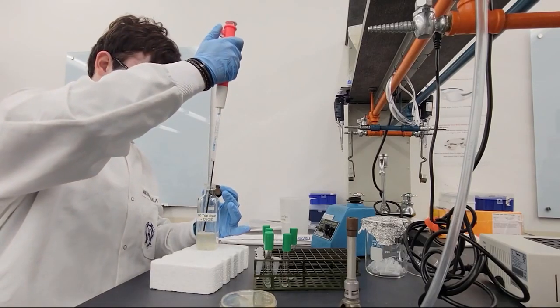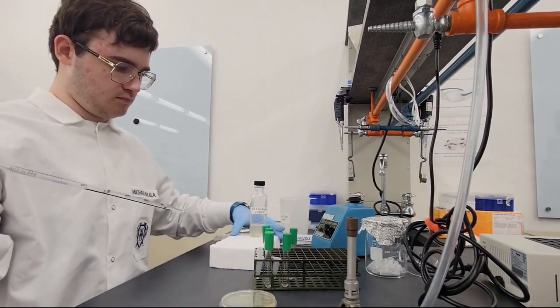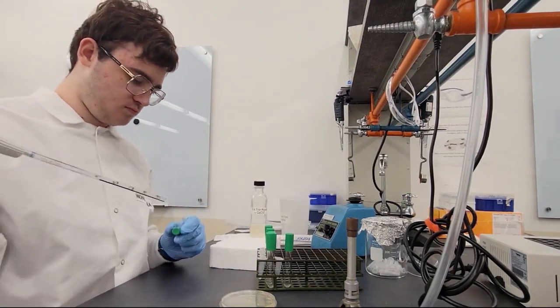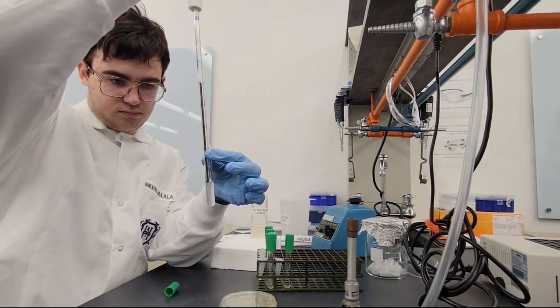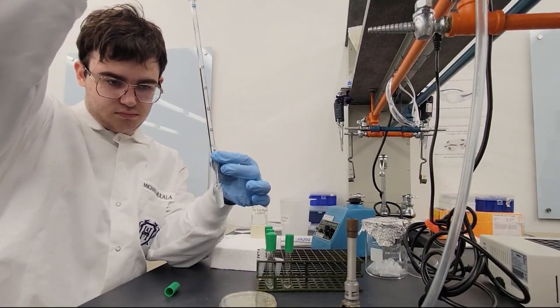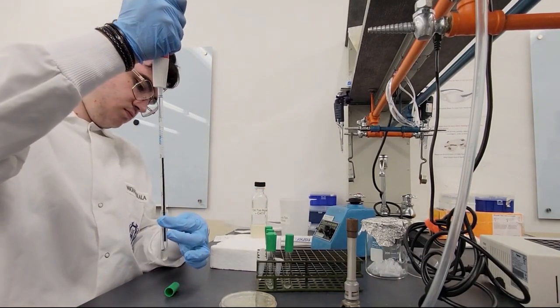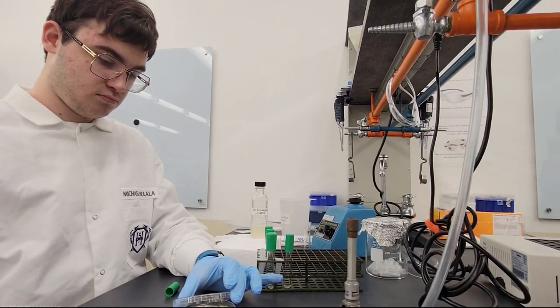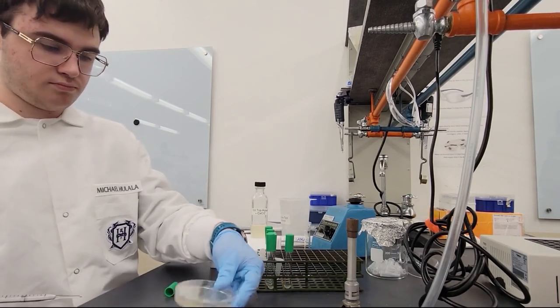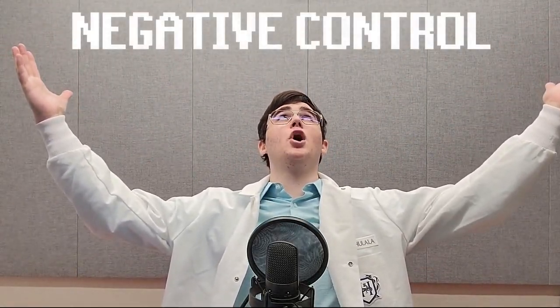This agar specifically has calcium added to it, because calcium makes the phage extra happy and it grows even more. So we're going to make a bacterial lawn, which is basically mixing up M. smeg and agar with calcium, and making this nice little flat surface with bacteria. This gives us a good understanding if there will be phage or not. We're going to take the top part, which hopefully has some phage, and we're going to dip it into half of the plate, just little itty bitty drops. On the other half, we're going to put phage buffer, which is just a simulation of the exact same environment as the phage, except there is no phage. This gives us the concept of negative control.